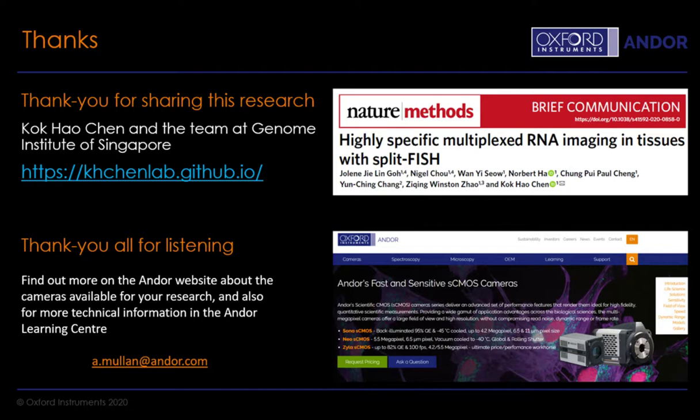Wonderful. Thank you so much. And our next question: how much of the transcriptome can you cover with split FISH?